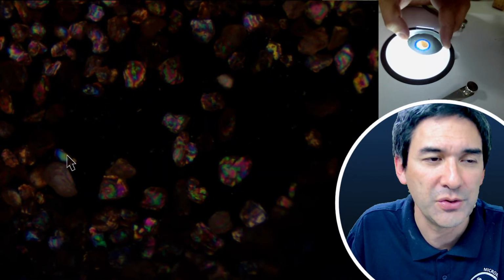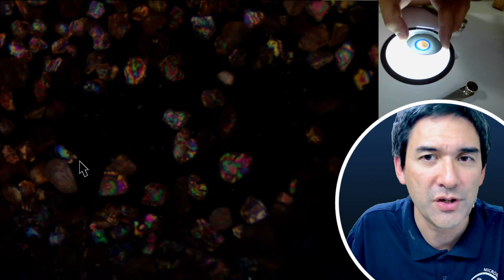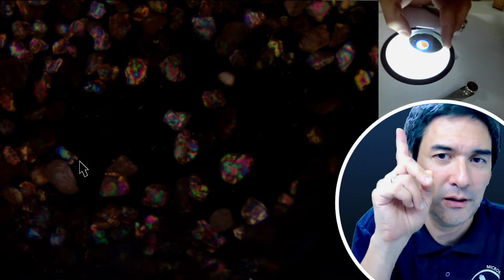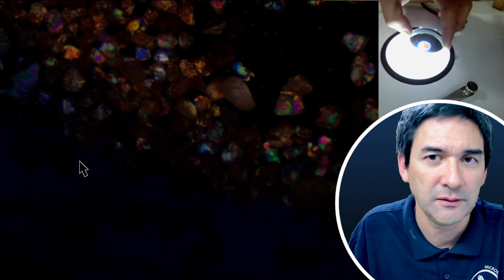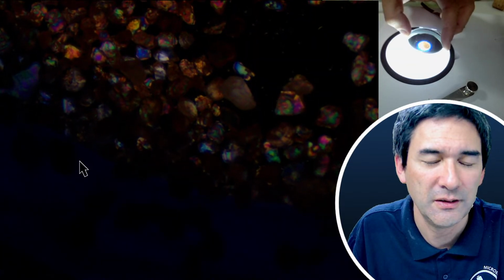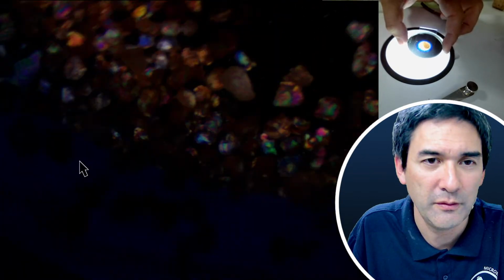Again, slightly those rainbow colors here. And also look a little bit at what I'm doing at the top here. Look how I'm rotating the filter, and how the bottom filter then seems to become darker as it's canceling out the light. Let's move everything a little bit here.